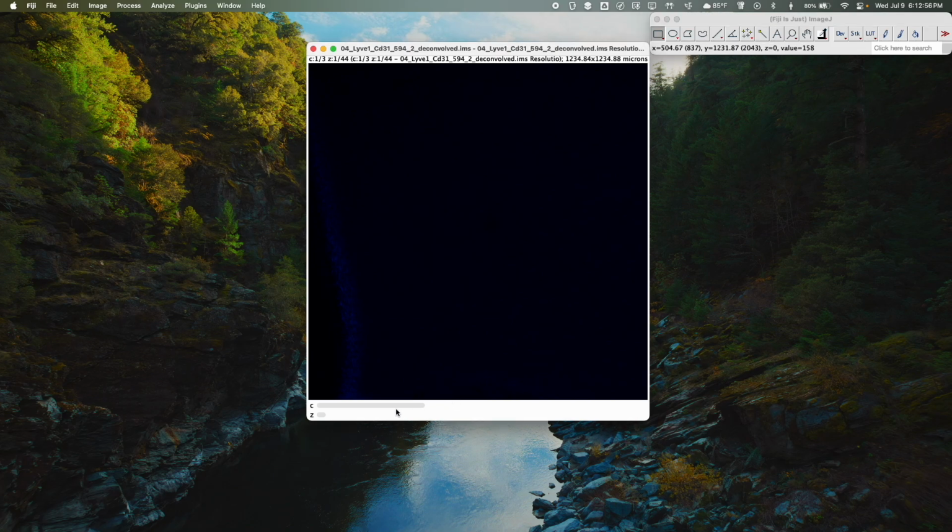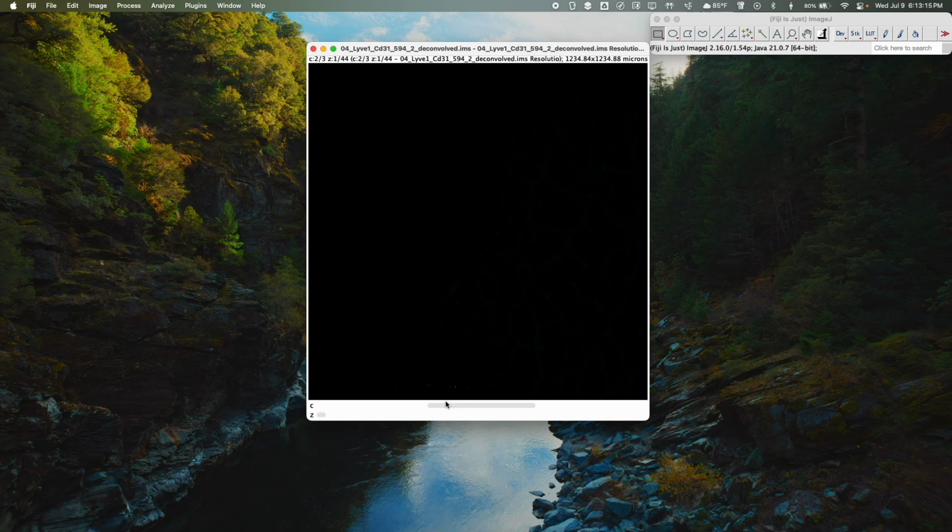I mean, the channel you can use to select what channel you want, or the color for the channel that you want, in this case, if you want to change the values for your brightness, contrast, minimum or maximum. They're split here, so you're going to need to individually do them before merging them all into one channel.